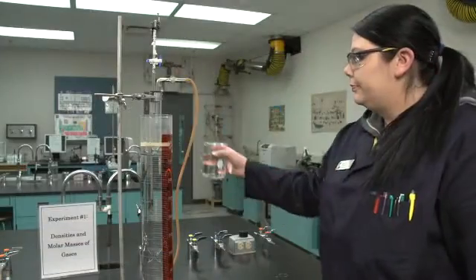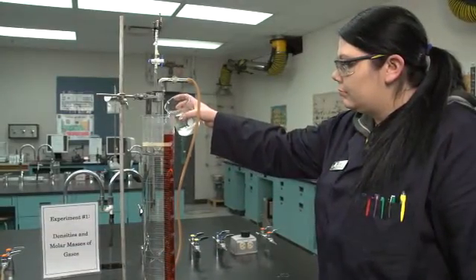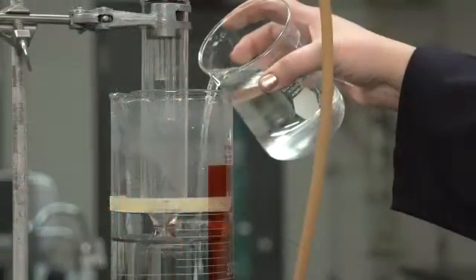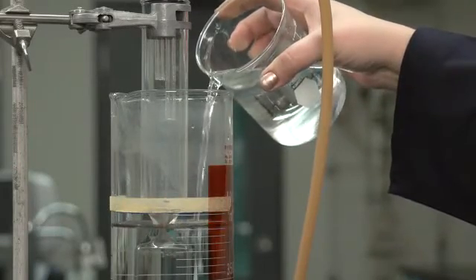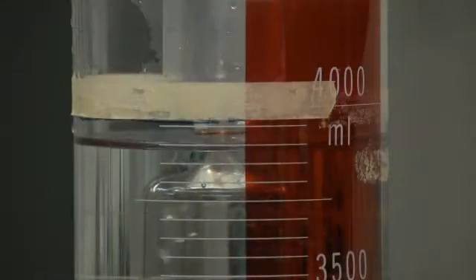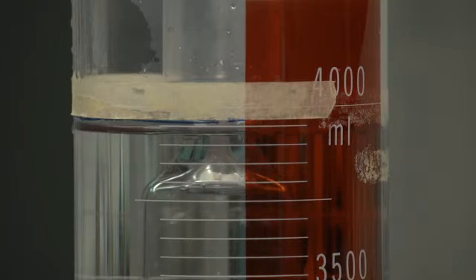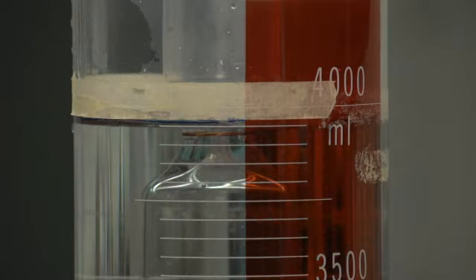The first step is to adjust the water level to the bottom of the tape. This is important because during the experiment, water might spill out of the graduated cylinder. The same amount of water must be present at all times so that the hydrostatic pressure is the same for every run.